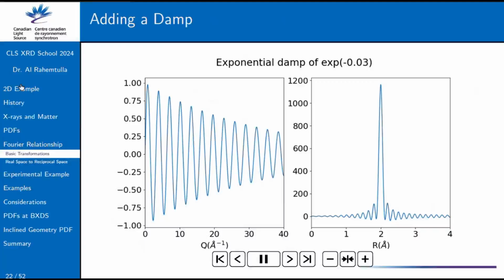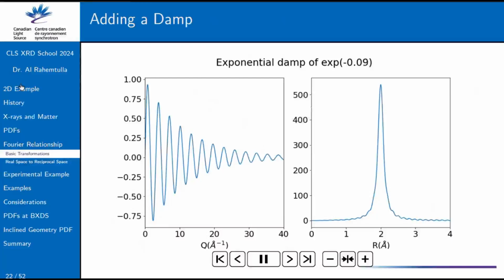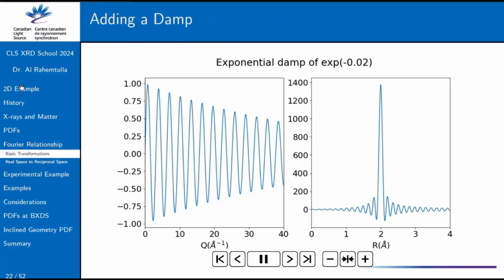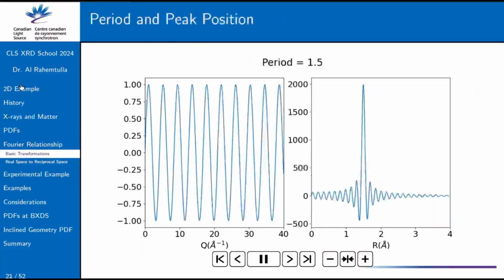And one question is, how do we judge that the peak is the peak, not the noise? How do we make the judgment? Like in an RDF, or in your scattering, in your PDF.